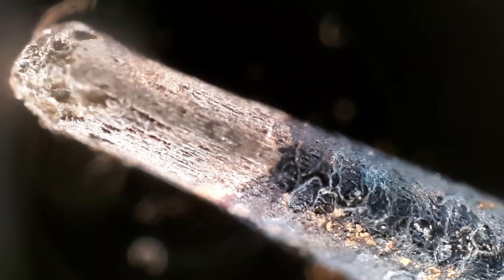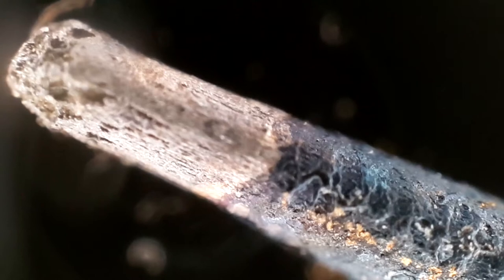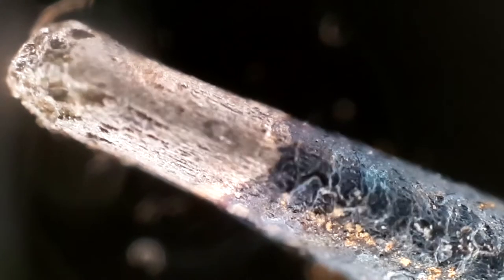Moving a little bit further down, there's definitely a sort of demarcation line there. Just pushing the table up and down to shift the focus. So this end tip behind, the sort of bit just behind the very tip of this metal, has these sort of long grooves in it, very similar, sorry, the same aspect as the actual rod itself.